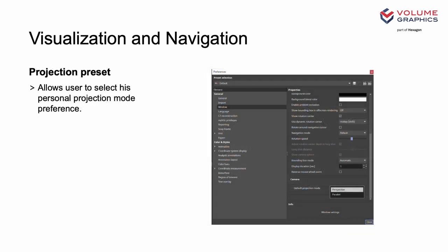Continuing on with visualization and navigation, for you CAD users out there, we know that the parallel projection mode is your preferred viewing type. We admit it could sometimes be frustrating having to reset this view every time you restarted the software. So what's the answer? Well, it's simple — we've now included the option to make this a preset.